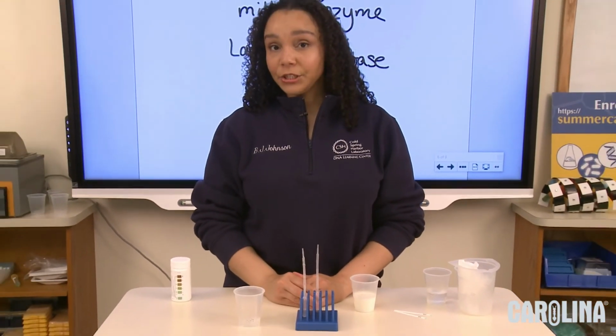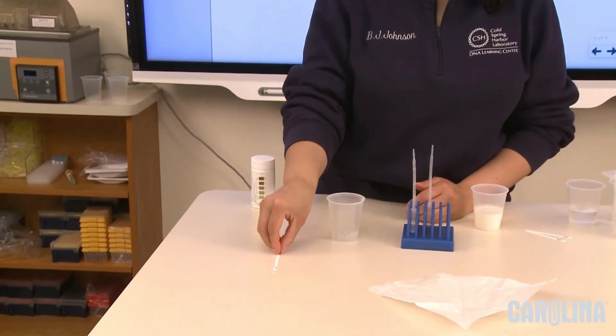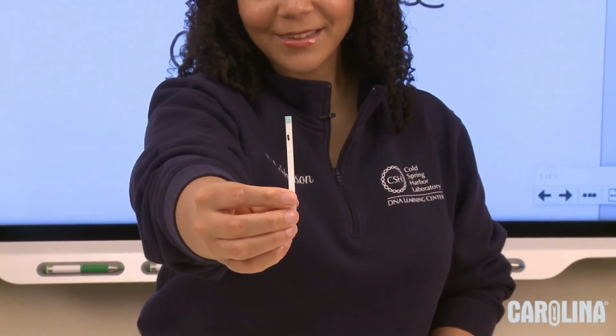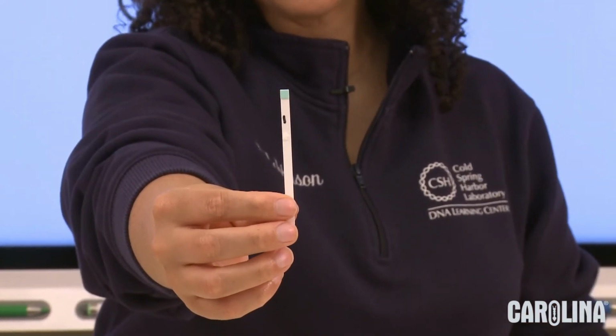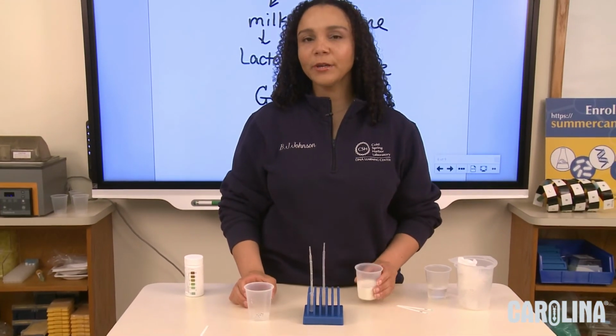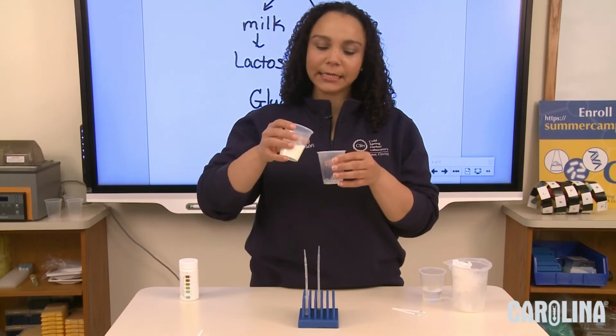Now, I don't see a change occurring, and I don't expect you to see a change occur, but just so you can see, the color has not changed. So now what I'm going to do is take the milk and add the milk to the cup with the lactase.